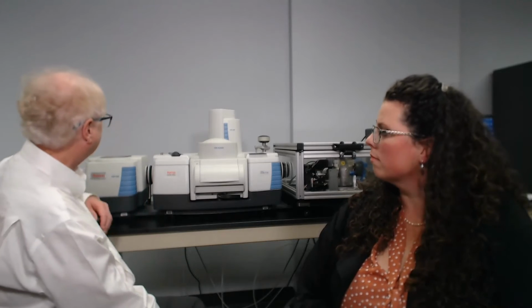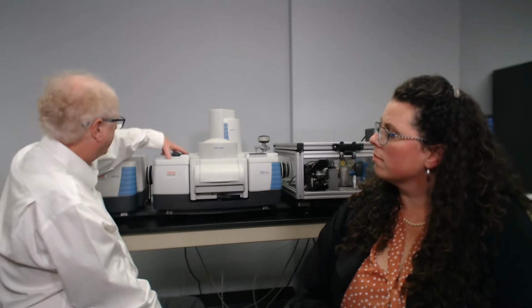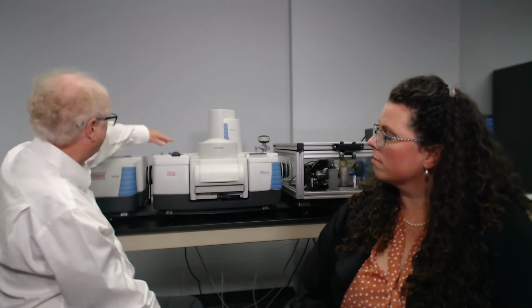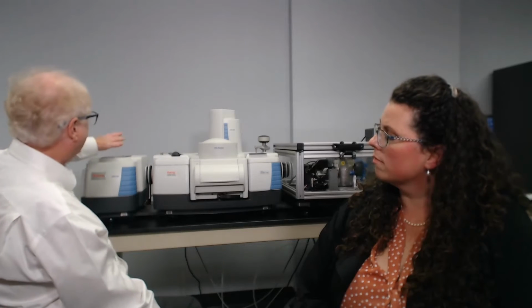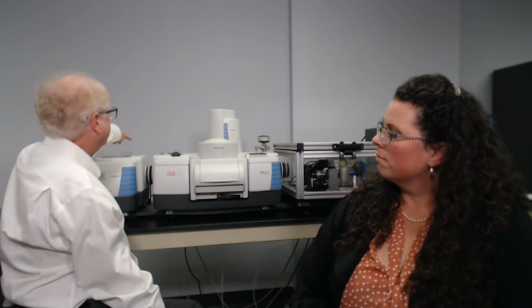Primary use here on this instrument is probably to develop methods which will then be implemented in instruments closer to at-line, on-line, near-line sort of applications. But the key point here is that the beam comes out of the Nicolet IS50, configured however you have it, and it comes into the module, and then the signal from the detectors which are built in here is transmitted back to the back of the Nicolet IS50. So that's more or less the left side.